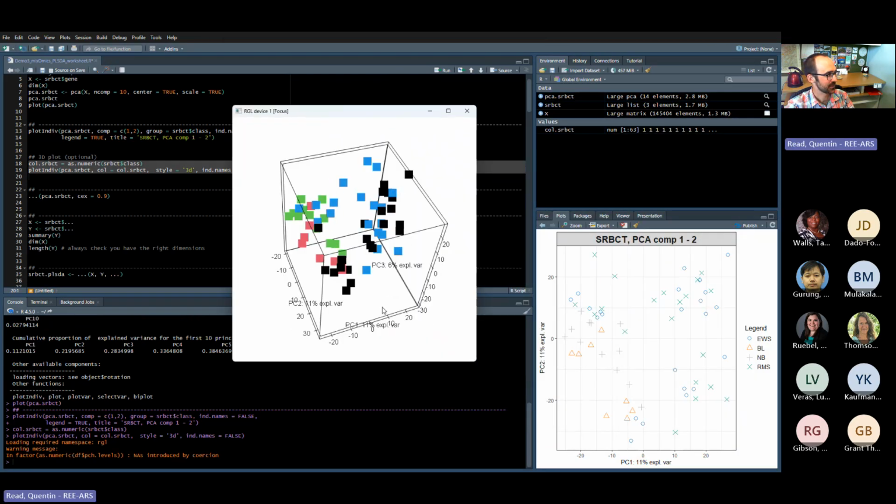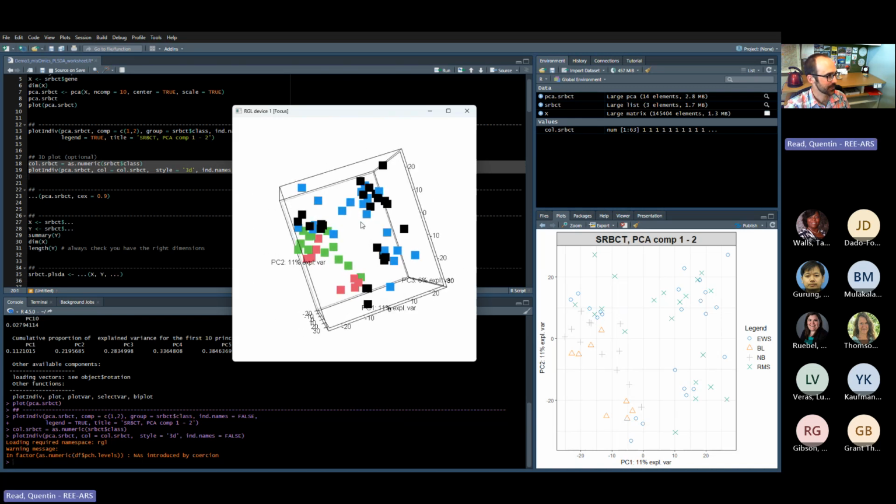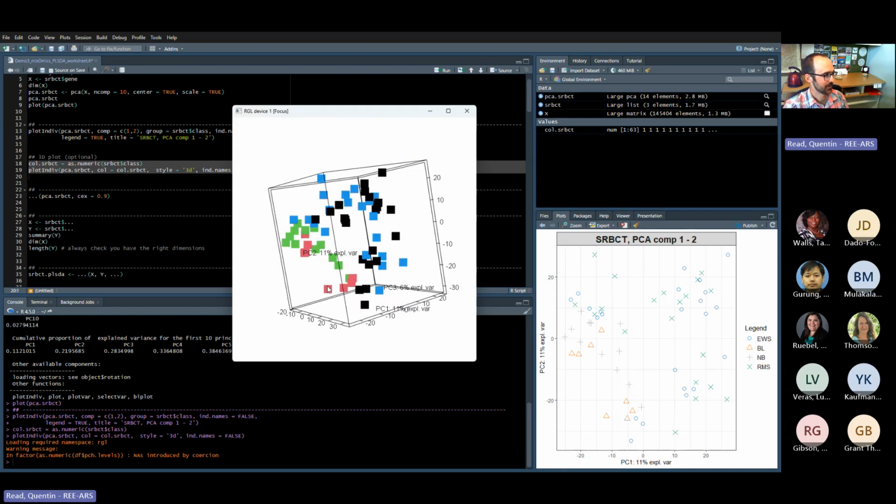So you can see it in 3-dimensional space. Once again, it's doing some separation: the red and green cell types are in one area and the blue and black in the other. So it's kind of separating one group of 2 from the other group of 2, but it's not perfectly separating the 4 cell types, even with 3 dimensions in PCA space.